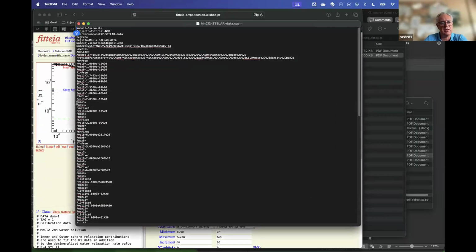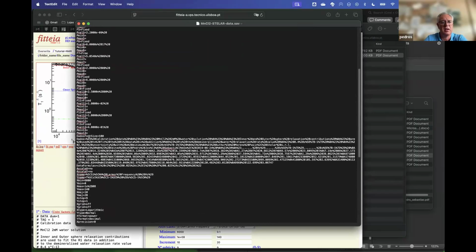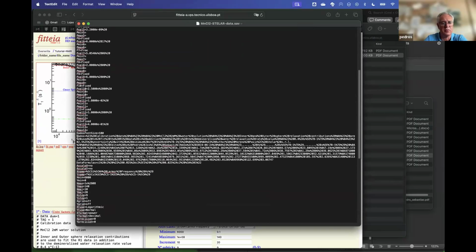It's defined in this format where you have a key and a value for that key, and it's a list of keys and values. Some of the keys, like dados, sorry for the Portuguese, it's data, and there is a long list of characters that contain the data.